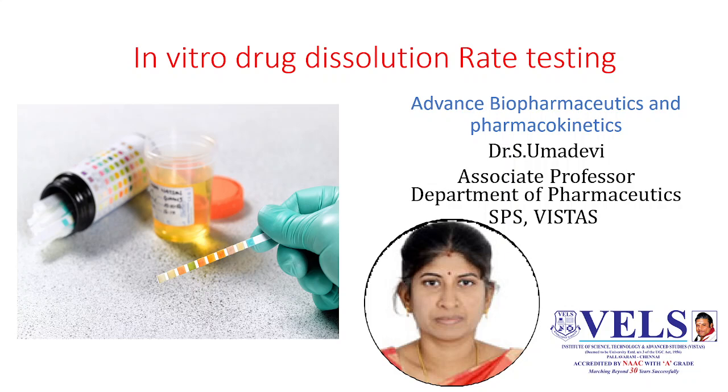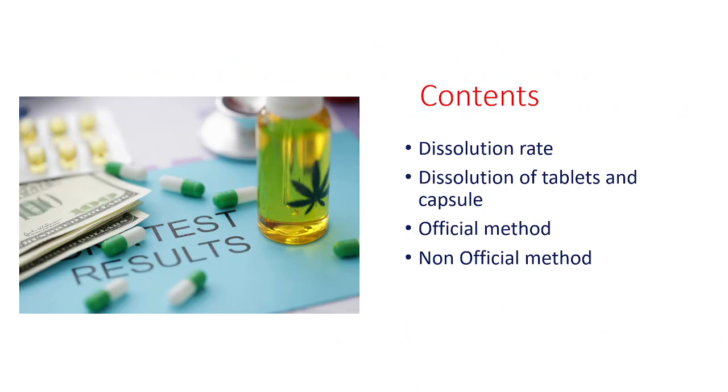Good morning, students. Today's lecture is about in vitro drug dissolution rate testing. These are the contents which we are going to discuss in this lecture: dissolution rate and dissolution of tablets and capsules, official methods of dissolution and non-official methods.